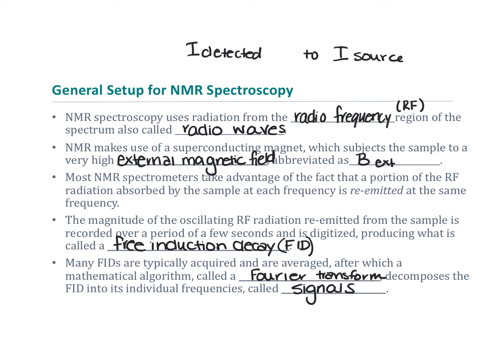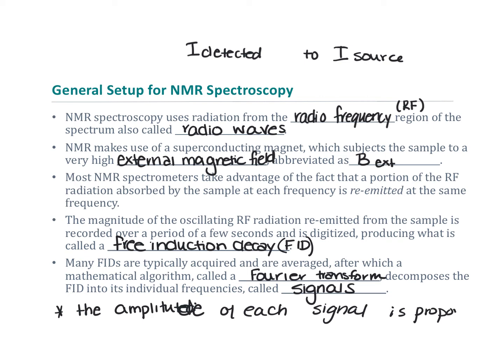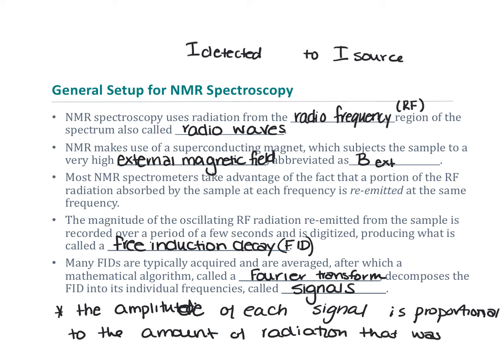Now, the amplitude of each signal is proportional to the amount of radiation that was originally absorbed.